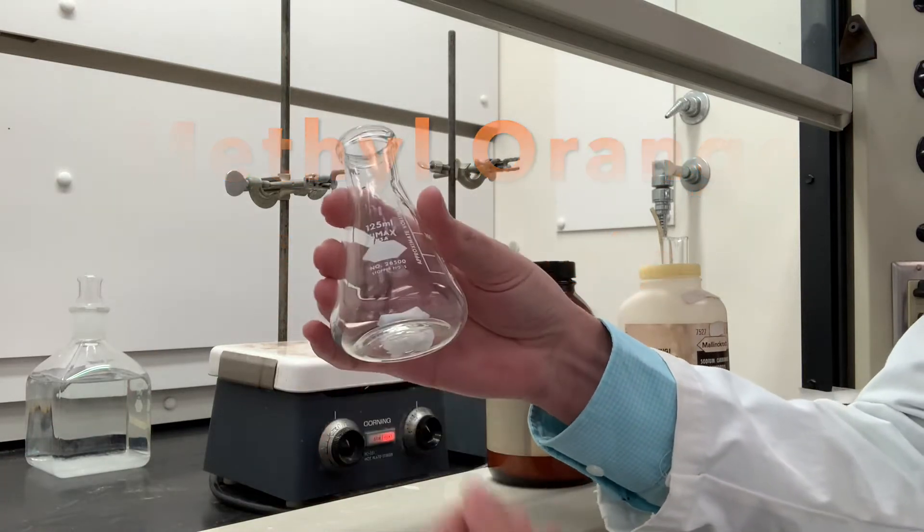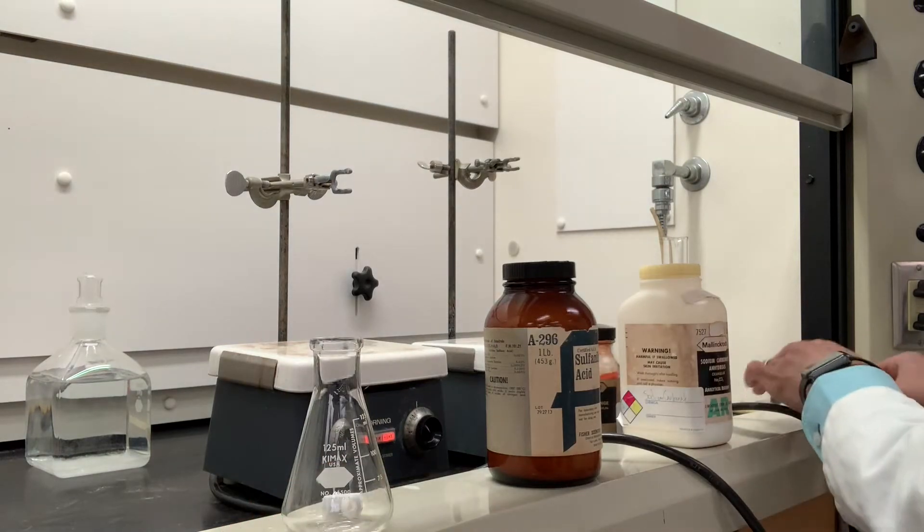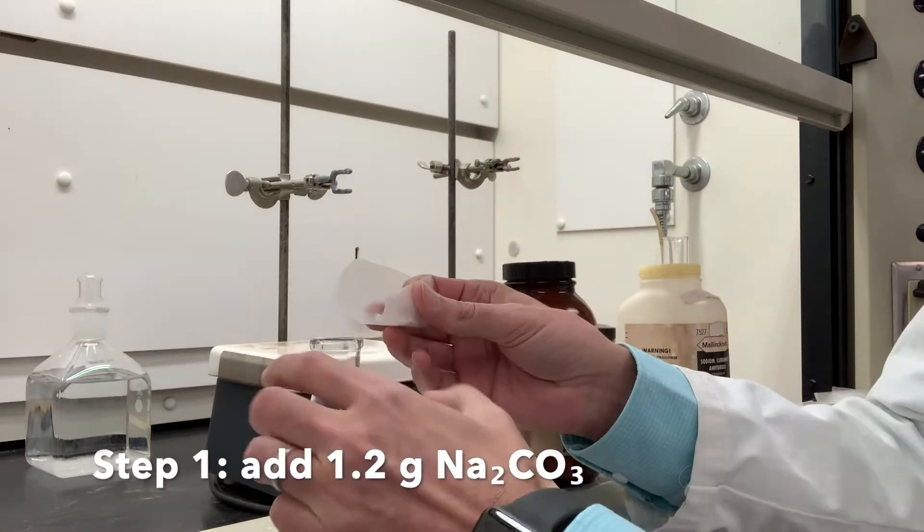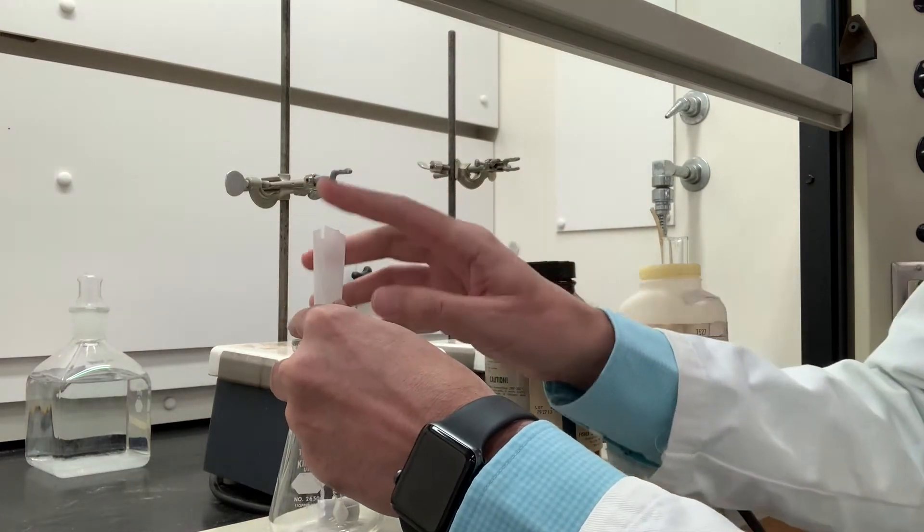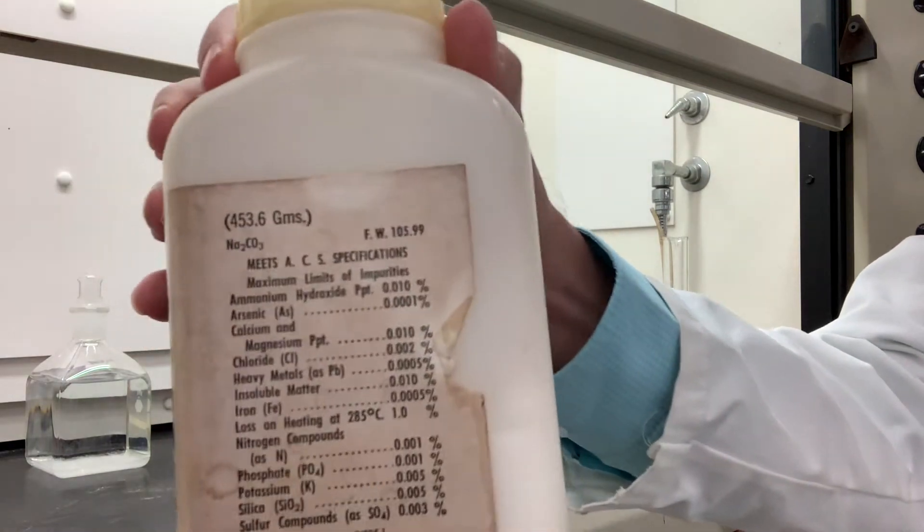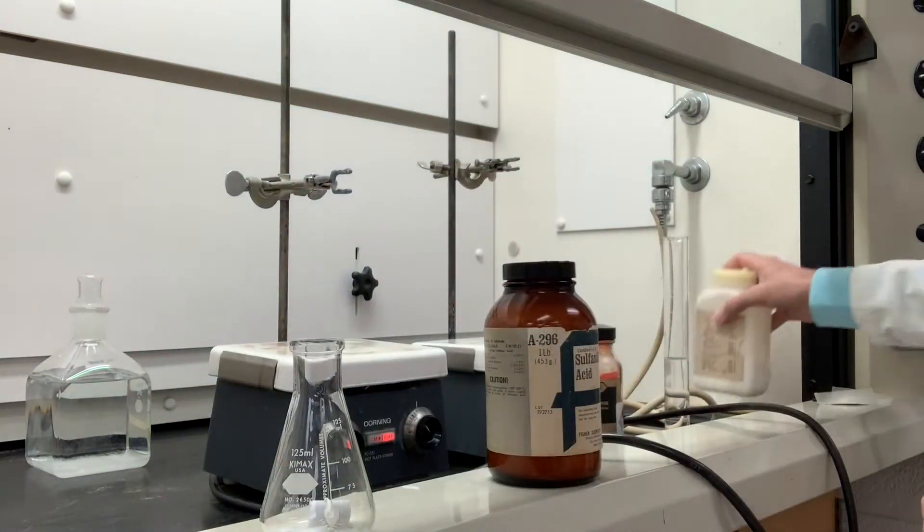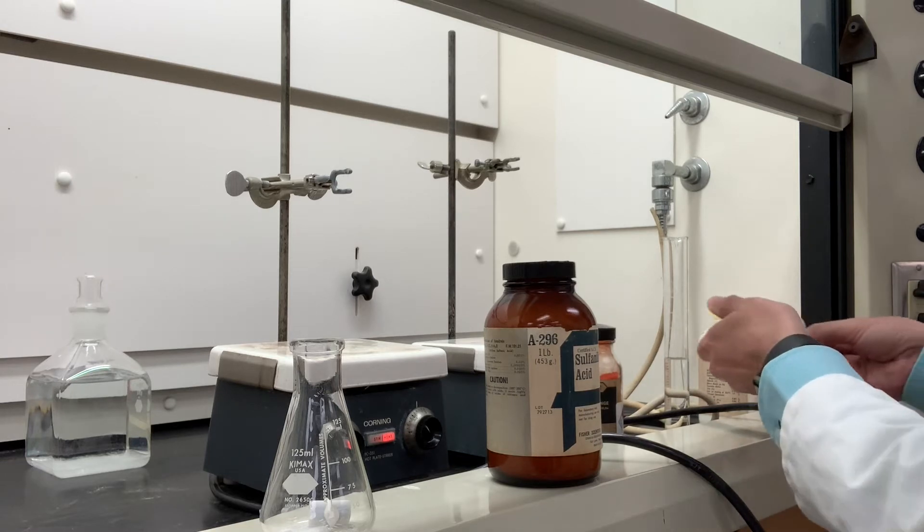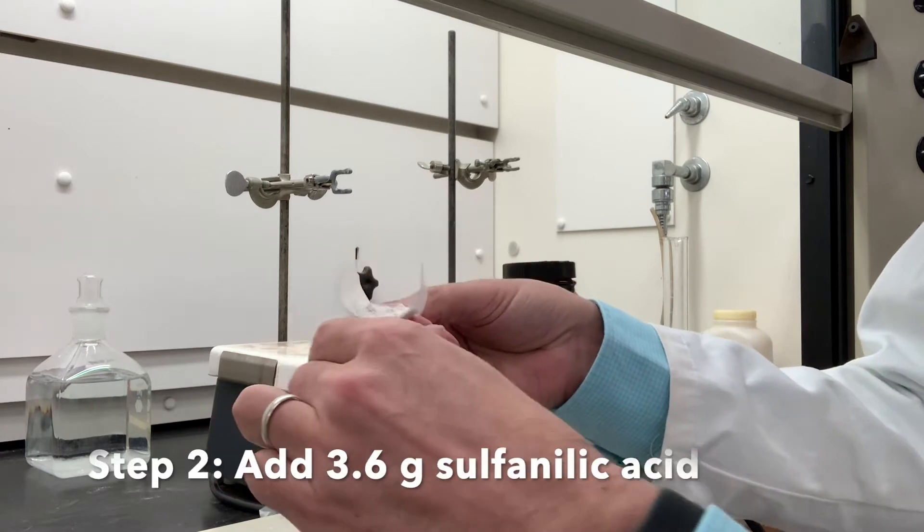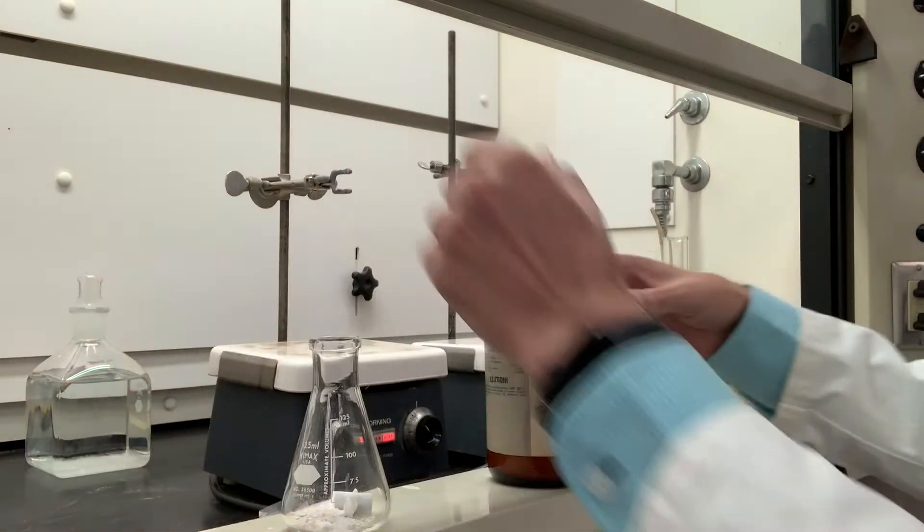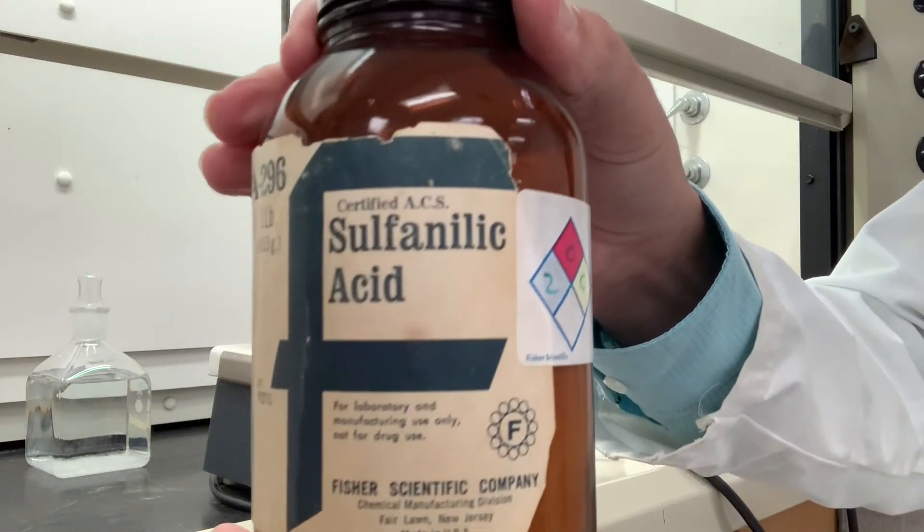We have a 125 milliliter flask here. We want to add sodium carbonate. Here's the information about the sodium carbonate. Next, we want to add 3.6 grams of sulfanilic acid. Here's the information for sulfanilic acid.